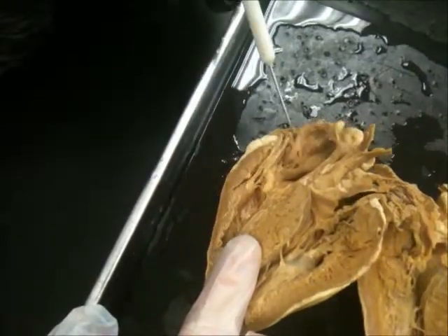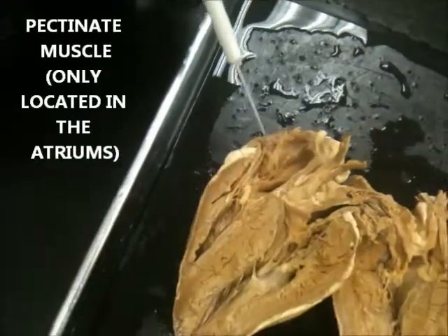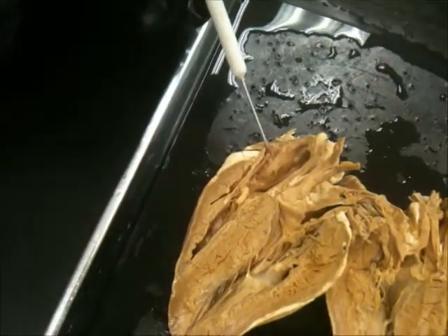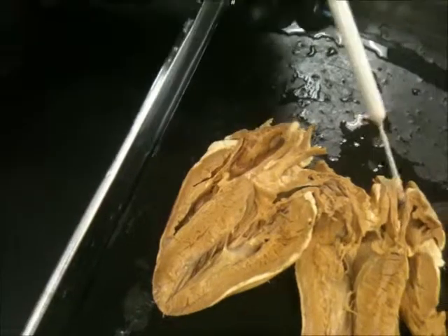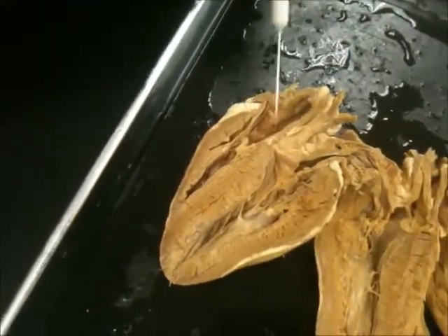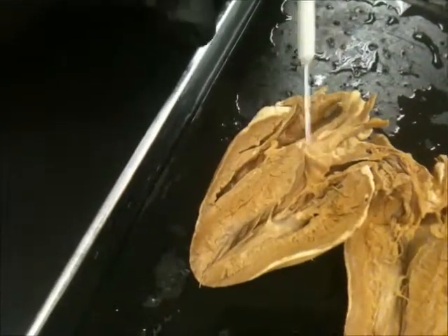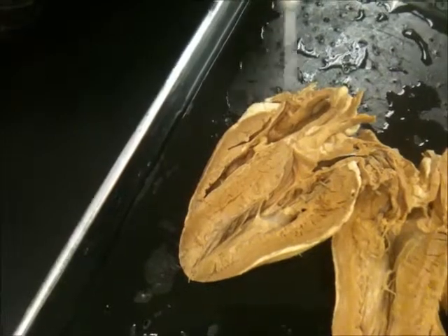The trabeculae carnae is just the muscle here. And the pectinate muscle is up here — these? Uh-huh. Pectinate is only in the atrium — the right atrium. No, any atrium, either right or left. It's going to be pectinate muscle, which isn't on our lab, so you can know it, but it was on our test.